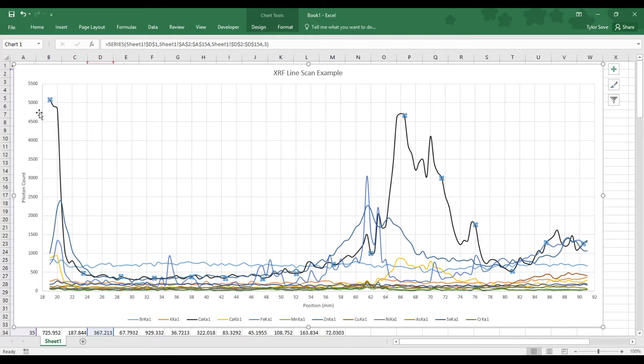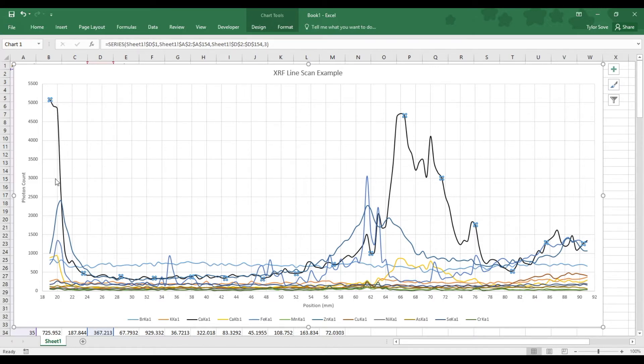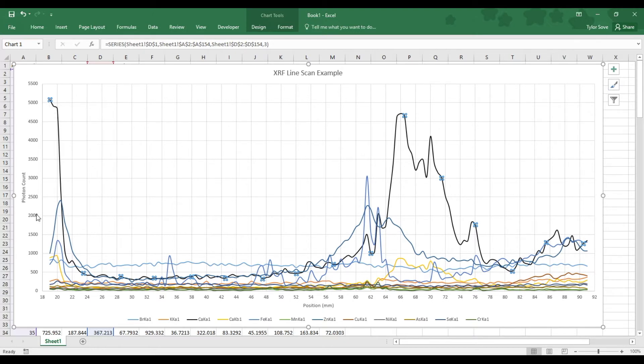They'll start off, drop, and rise at the same positions. It's the relative magnitude between the two. There'll be roughly five to six times the height difference between the K-alpha and K-beta.